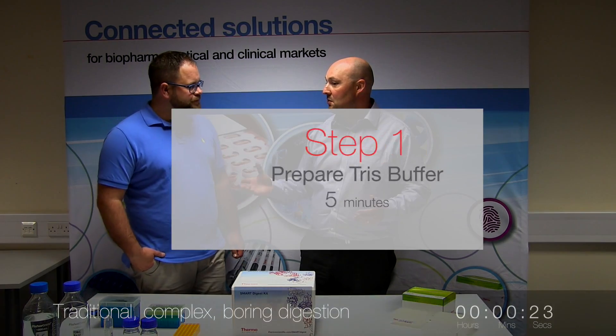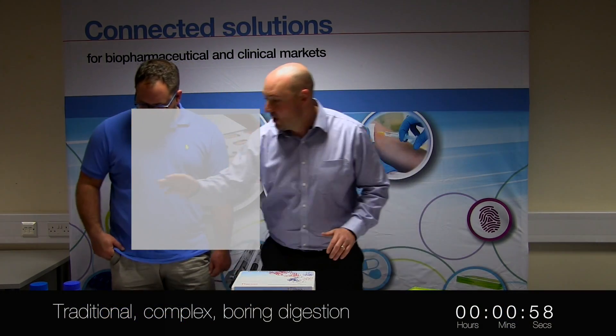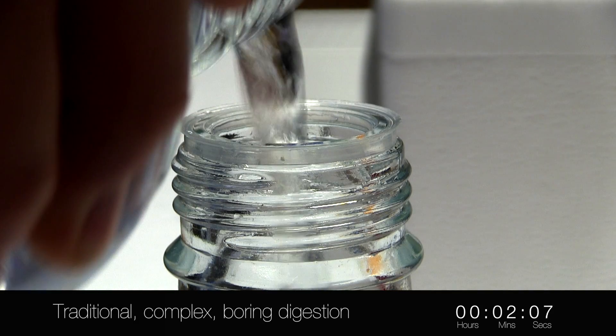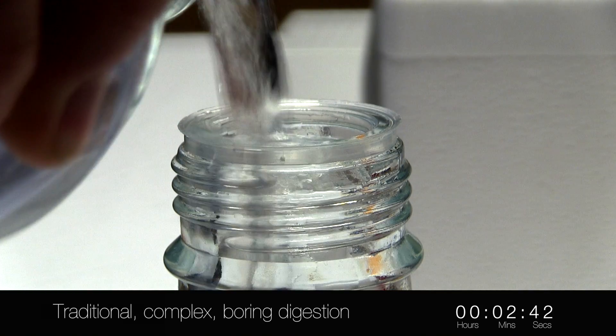Then we're going to compare that to some of the new innovative technologies that we've developed. The first thing we're going to do is make up our Tris Base — 12 grams of Tris Base in here. Can you add 450 mils of water to that and shake it up, Mark?